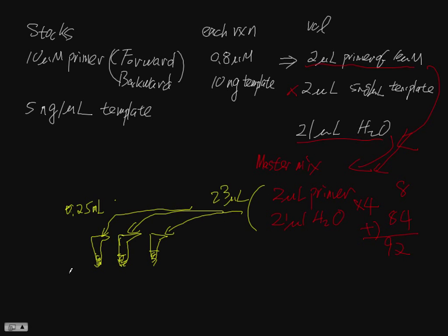And then you make sure you label the tube. One of them should be PMSH2. Another one should be a mutant U.S. And each group has their own mutant. You should label it mutant something.